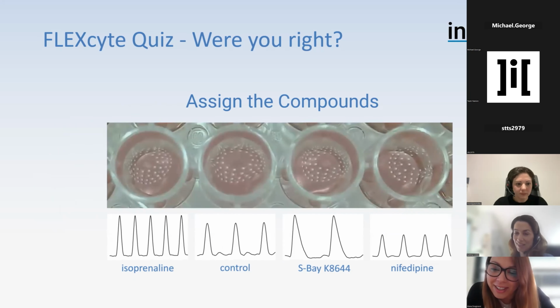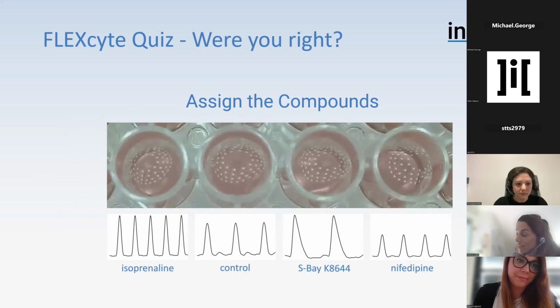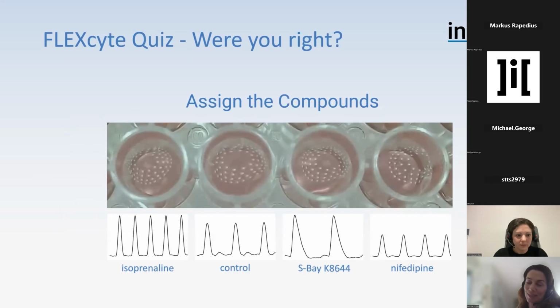So the first one came from Martin Trebert. Can you co-culture the smooth muscle cells with endothelial cells? Well, this would definitely be something that would be a follow-up, because that was an initial study. We wanted to get everything in place, but yes, perfect question, and it will be noted down, and we'll probably be able to present something like that in the next cardiac safety meeting.